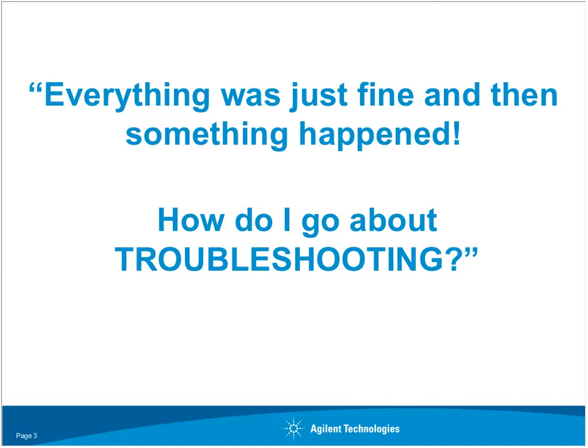And again, I understand your frustration. I understand that you think, they're asking me these redundant questions that I know I've done or I haven't done, whatever. But I can assure you the intent is to help you in any way that we can. Again, some of the questions will be redundant. We go through some things, but some of the smallest details can create some of the biggest problems.